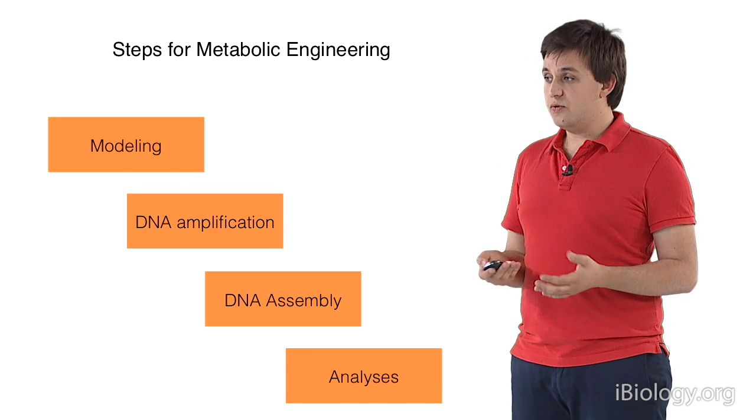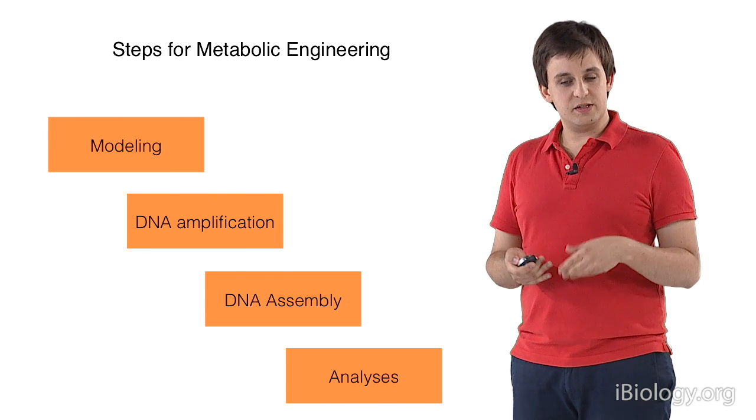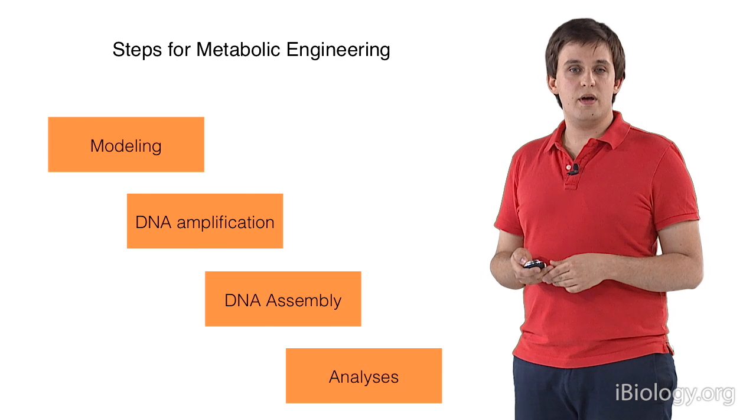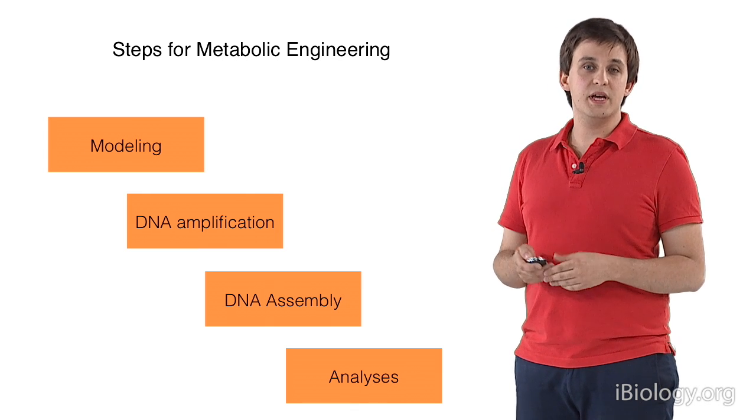So we can move on to the last step, the analysis. It's actually great because our analysis is a visual output, and our cells should produce now beta-carotene. Let us have together in the lab a look if they do. We show you now our results of our little experiment. Pavel explained to you how to model a biological system to find the pathway that we want to implement.